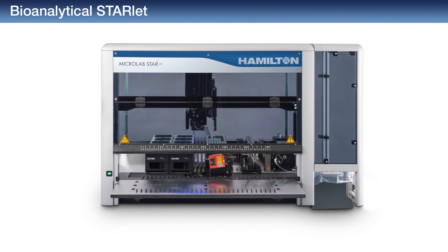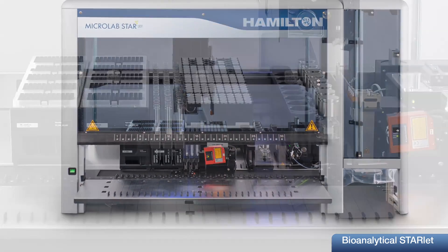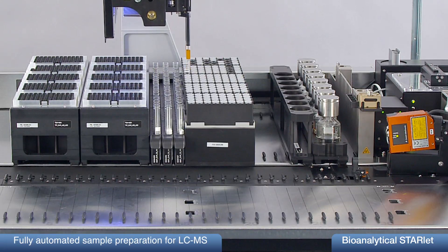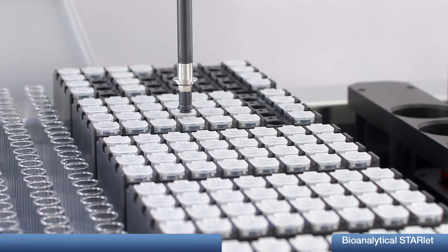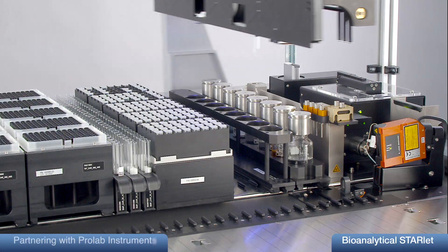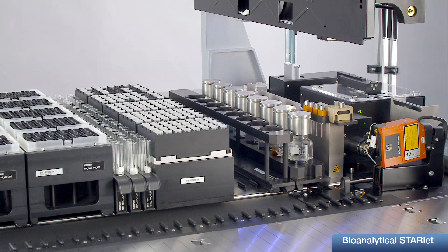The Bioanalytical Starlet is a unique system developed by Hamilton for the automation of sample calibration point and QC curve preparation for therapeutic drug monitoring and diagnostic routine. ProLab Instruments, the partner of Hamilton, is known as a reliable partner for successfully marketed customized analytical instruments.